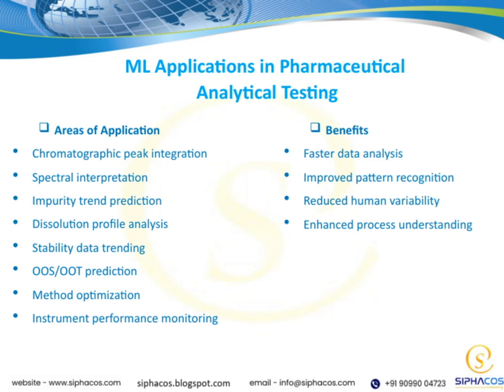Method optimization is another crucial area, where ML assists in refining testing procedures, and instrument performance monitoring ensures our equipment stays at peak performance. Overall, these applications demonstrate how machine learning can significantly enhance efficiency, accuracy, and reliability across the entire analytical testing process, supporting our goal of delivering high-quality pharmaceuticals.